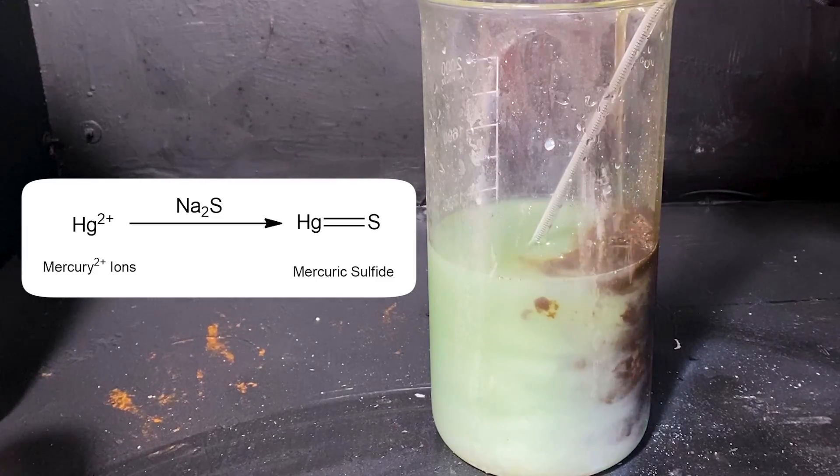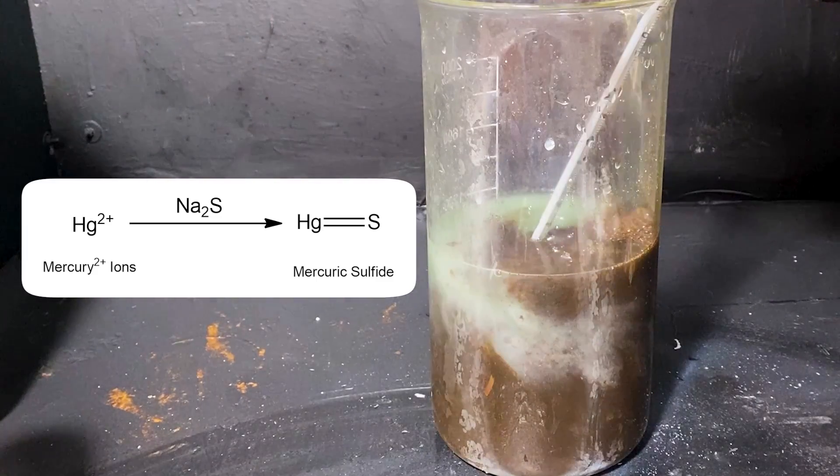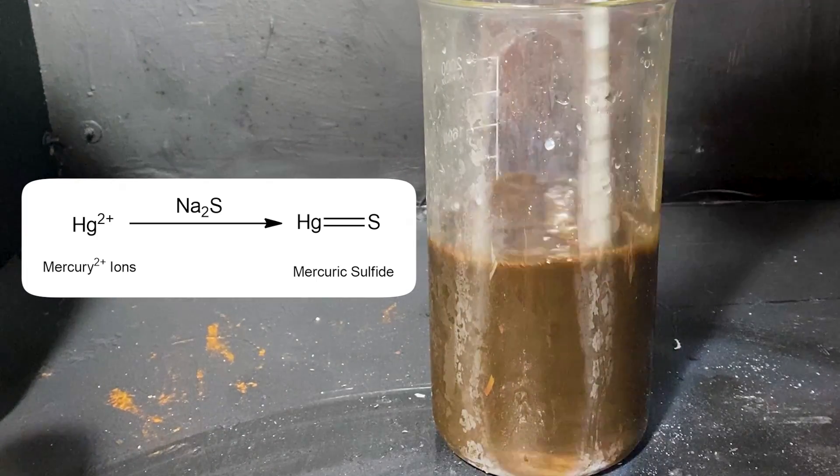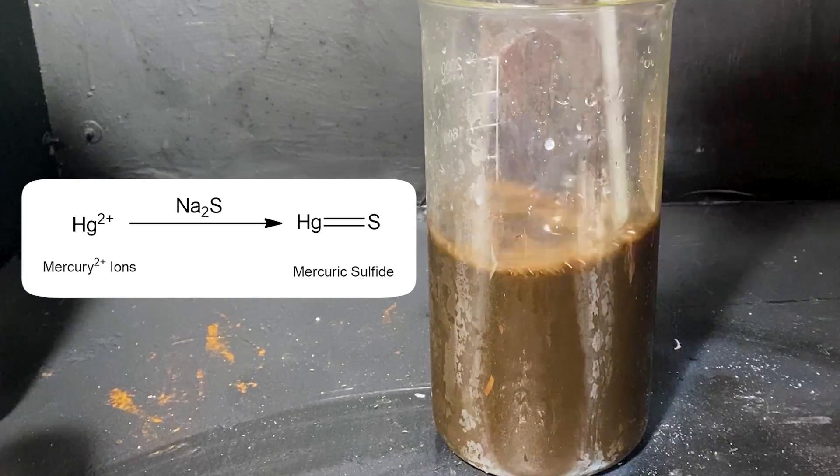Cinnabar has two forms, the alpha form and the beta form. Here it's in the black beta form, as I've just crashed it out from the solution. Naturally occurring cinnabar is in the red alpha form, due to a different process of formation of the mercuric sulfide.